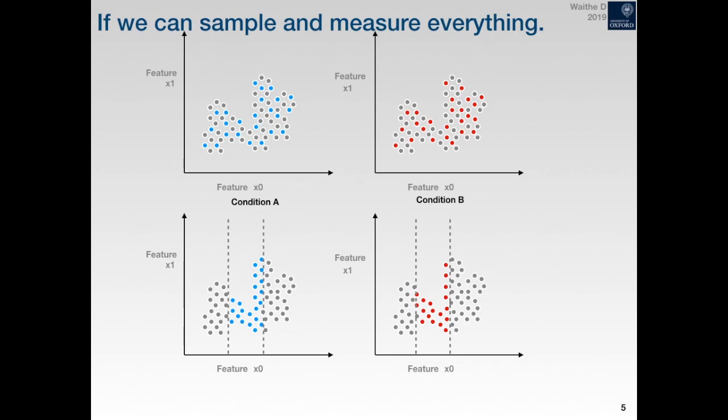But then there's still a narrative for how we did the experiment. So when we do our publications, we can show this underlying distribution and we could write down and explain why we chose this particular range of cells and justify it. And this would form a narrative for future scientists to question your methodology and potentially look at a different part of the population or another aspect of it that they found interesting. But the problem at the moment in science is this part of the acquisition is very poorly explained, and there's no narrative to really question it in a scientific way.